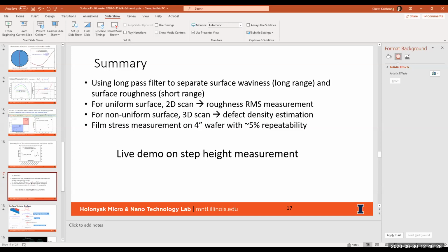However, if an individual group would like to purchase your own, changing the stylus is actually very easy to do. So there are some other laboratories where individual groups actually purchase their own stylus, especially for the very fine one. And we can change it for you for your measurement and do it that way.